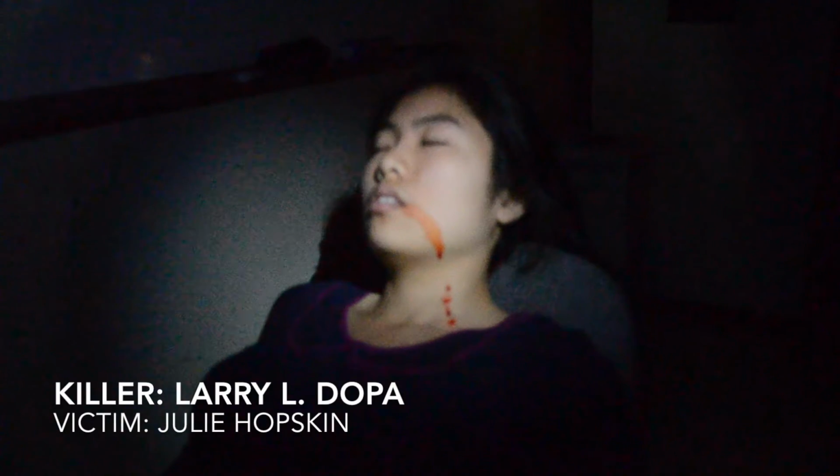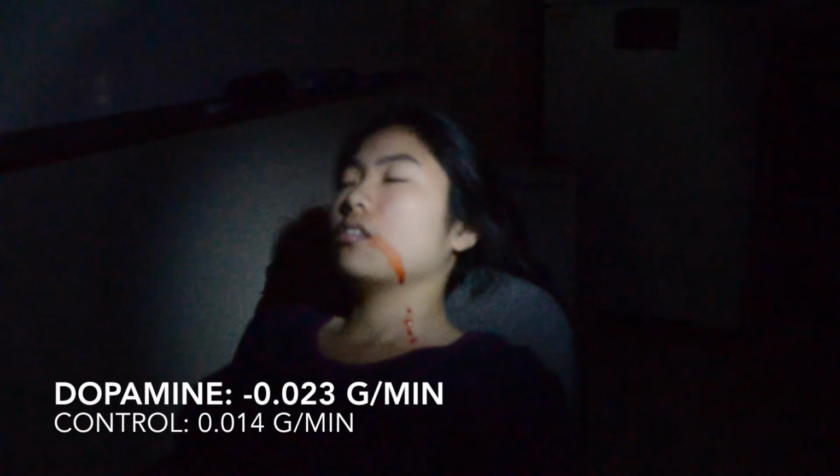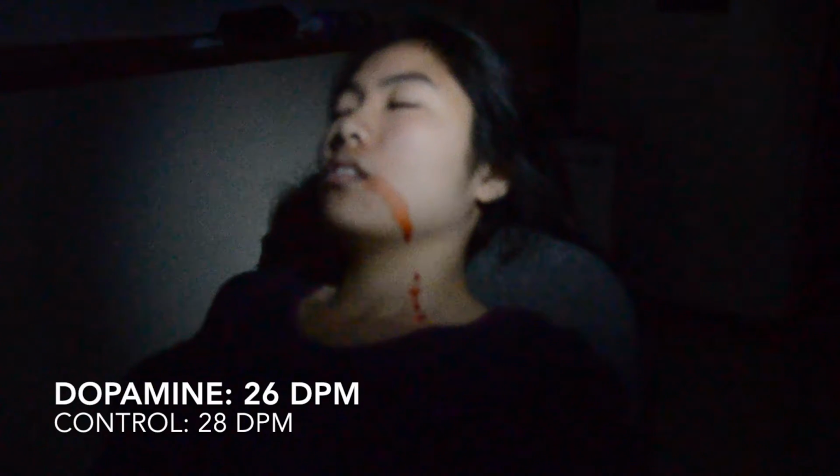The name of the second victim is Julie Hopskin. She was killed by Larry L. Dopa, which is dopamine. Her wallet was stolen, which indicated a weight loss from 0.014 grams per minute in the control to negative 0.023 grams per minute with the treatment. There was no blood pooling, just a small amount of blood dripping from the mouth, indicating a decreased fluid drip rate of 28 drips per minute to 26 drips per minute.